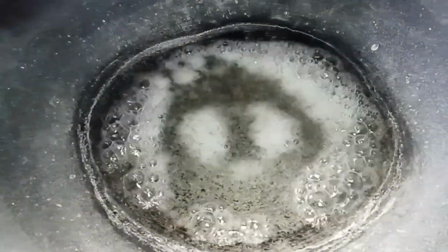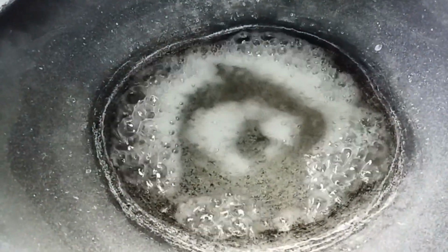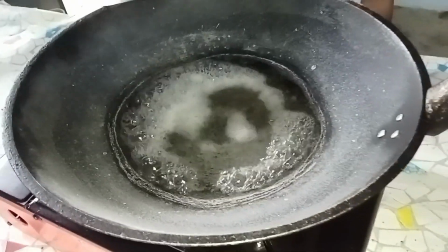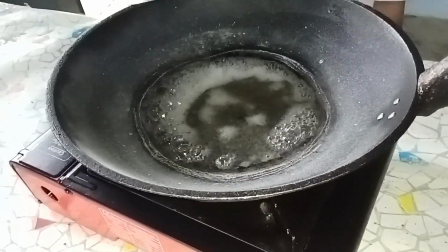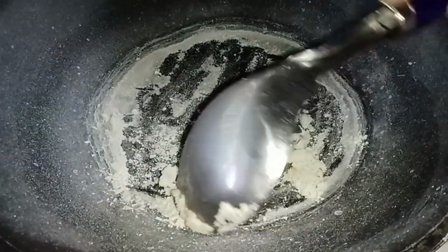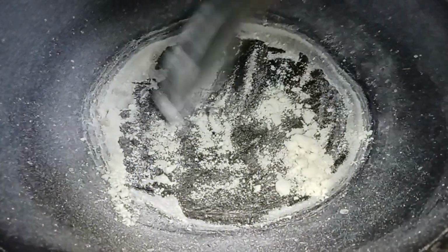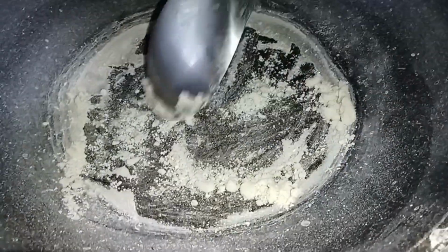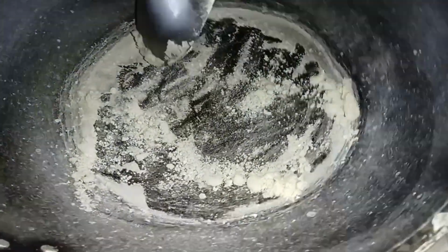As you can see, the water gradually turns into vapor and escapes into the air, leaving the salt behind. This happened because water has a lower boiling point than salt, so it evaporates first. The process of evaporation does not involve any chemical changes. The salt that remains is still the same substance; it only changed in appearance.